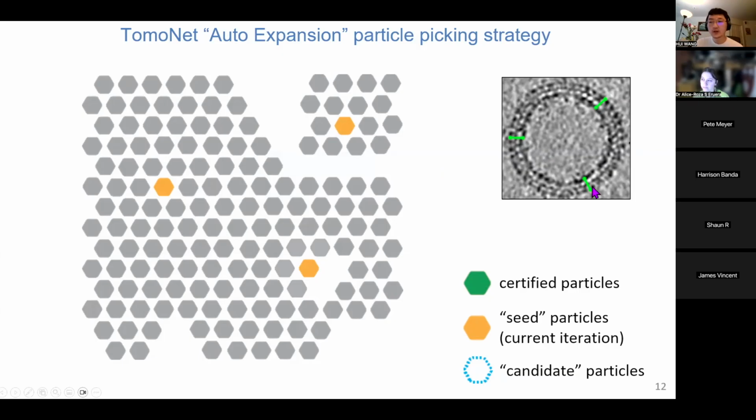These marks represent the user input of what we call the initial seed particle. Basically, you can imagine this is a seed. It will try to search for its neighbor candidates and evaluate them based on their density. For example, you can see that the others will be accepted as accepted particles, but these two will be excluded.